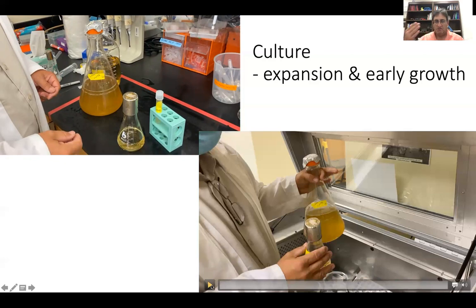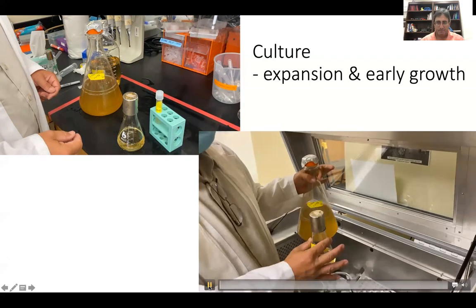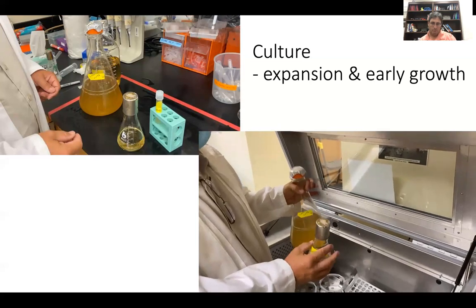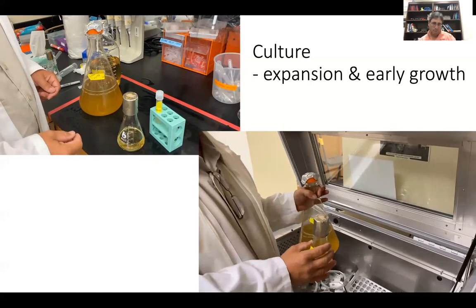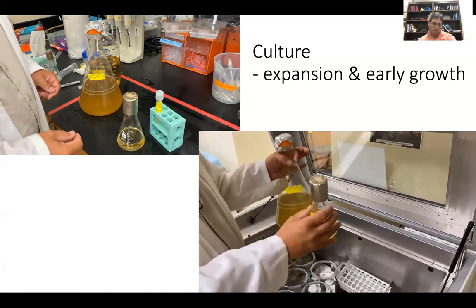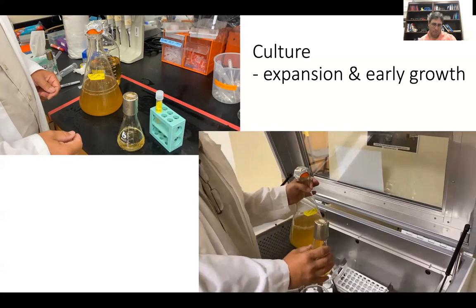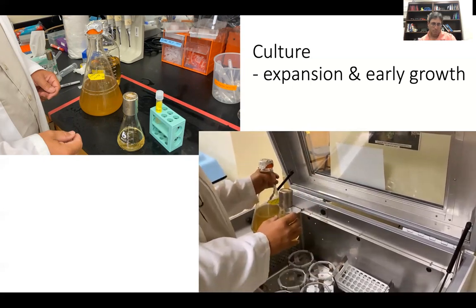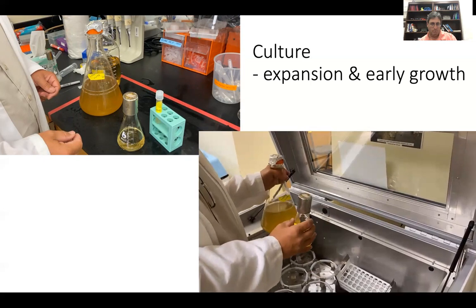Now we've seeded with our starter and we're expanding. Not yet adding IPTG. Let these incubate in culture at 37 degrees. These clones we know like to express better at colder temperatures for a longer period of time. So we'll start the pre-induction culture at 37, then we will cool them down to 20 degrees and then induce.